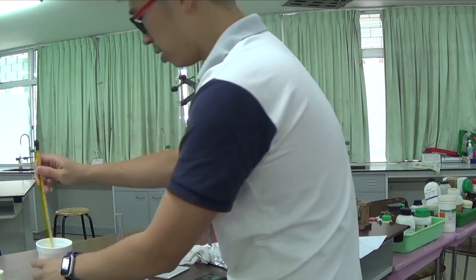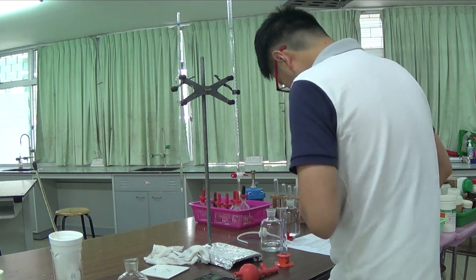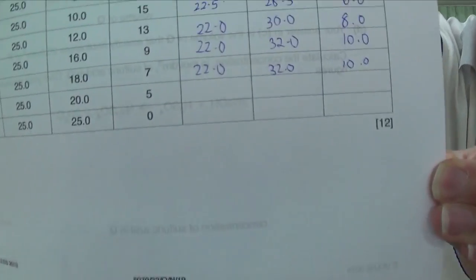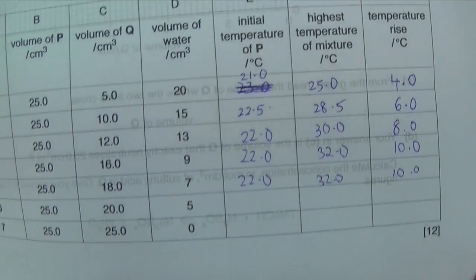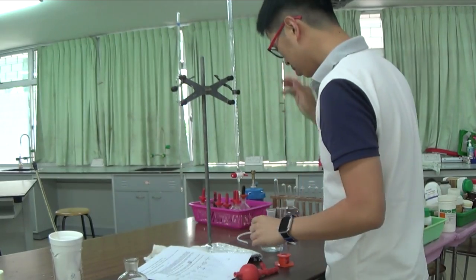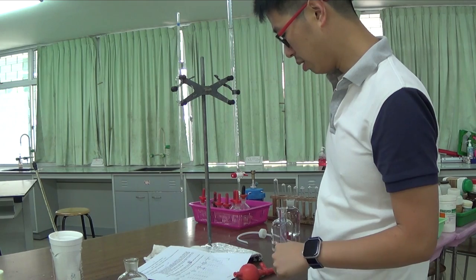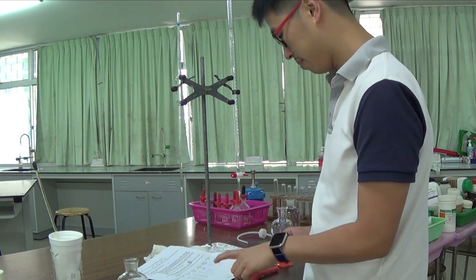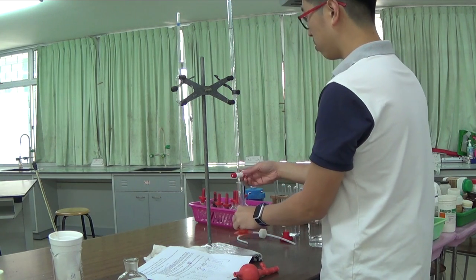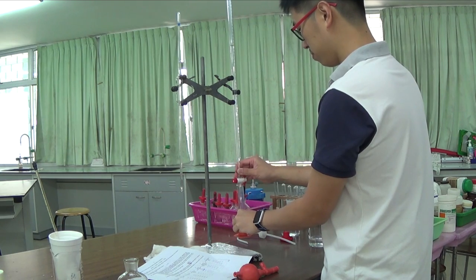So this thing was ready to rinse. Just let it sit there. The next experiment actually requires 20.0 cm³ of Q. I am at 18.00, so 20.00 plus 18.00 is 38.00. So I will let it run until it goes to 38, then I will do drop by drop.